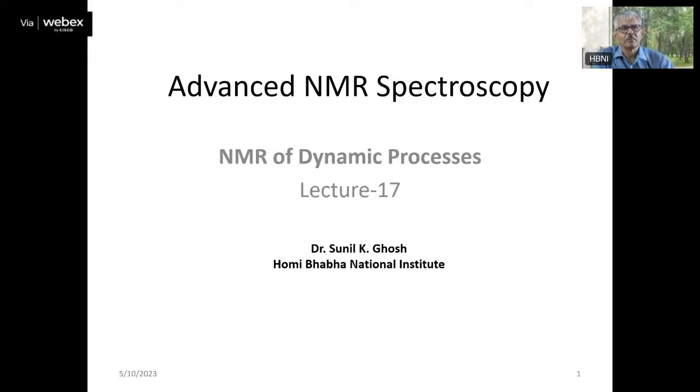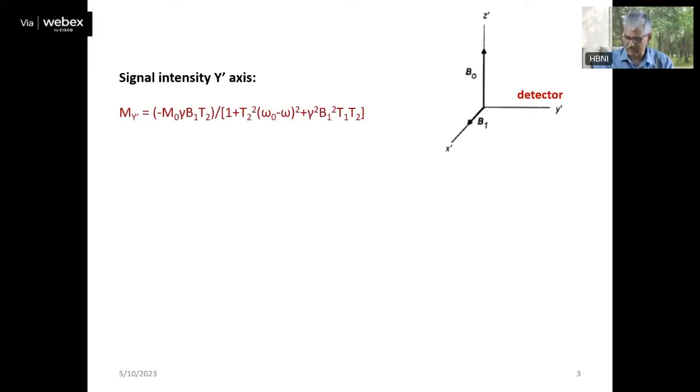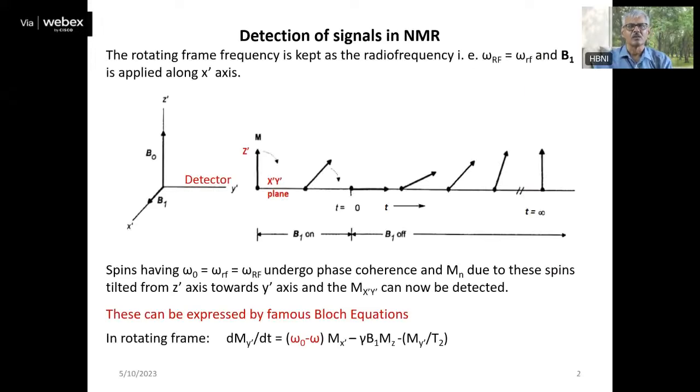Okay, welcome to the Advanced NMR Spectroscopy course. Today I'll start. The topic is NMR of dynamic processes. Before we go to that, I'll just remind you of something I covered in one of my earlier lectures: how you detect the signals in NMR.